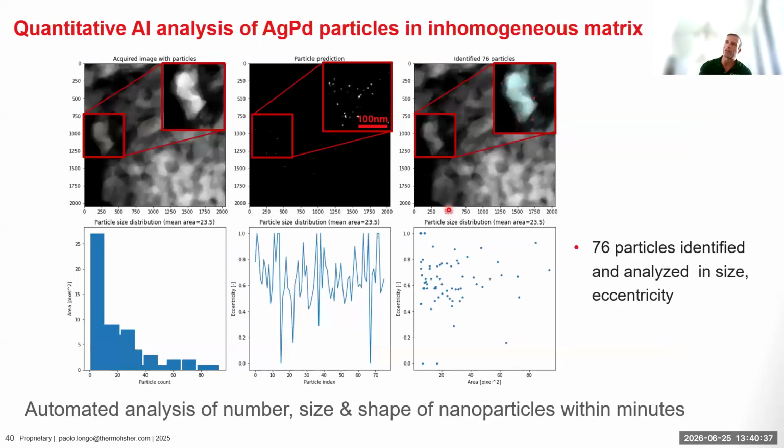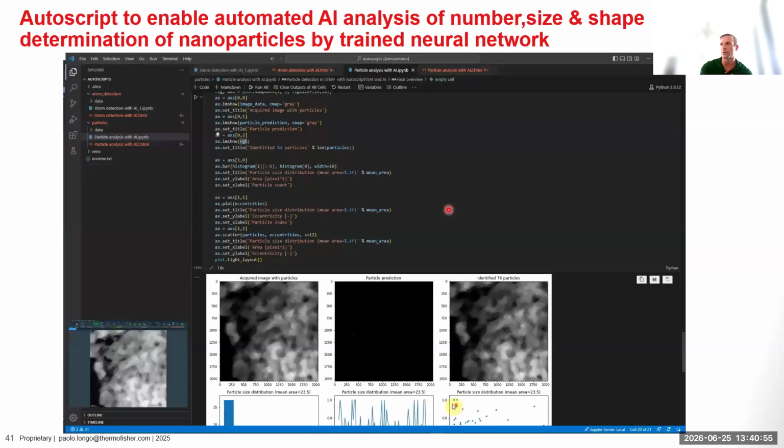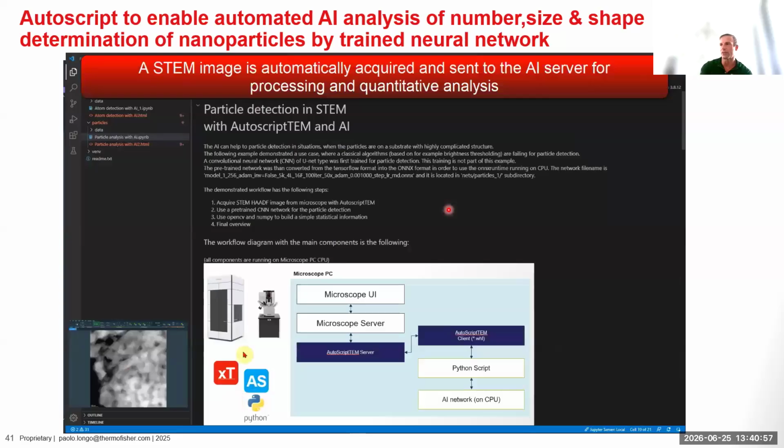And I'm going to show you a video here, where this is a similar example to what I discussed before in the case of BSE, basically finding particles and trying to get every possible type of information out of these particles here. So here we're launching the application.